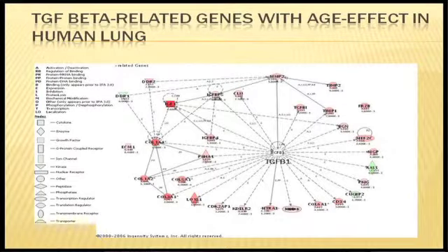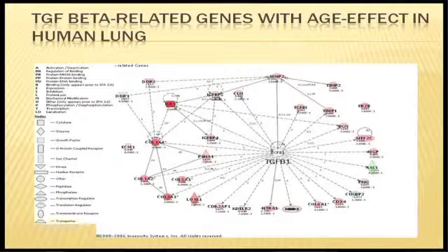Now this is what's really cool: not only can you see a footprint left at the scene of the crime, but you can see it from a distance, right? So here we have TGF-beta 1. And this gene is regulated post-transcriptionally. So changes in the activity of this aren't at the expression level, it's at the protein level. So we don't see this in our list, right? But if we look at all the genes known to interact with it, they all go up, right?